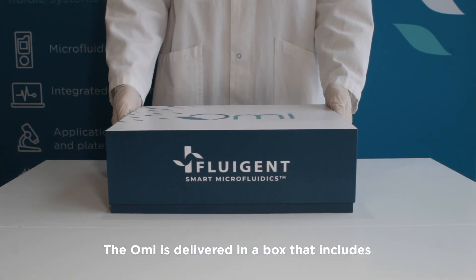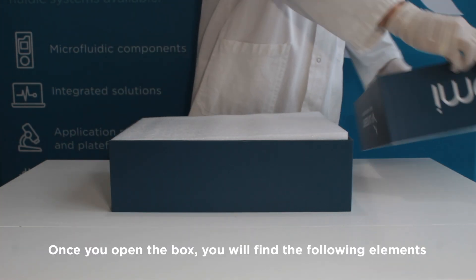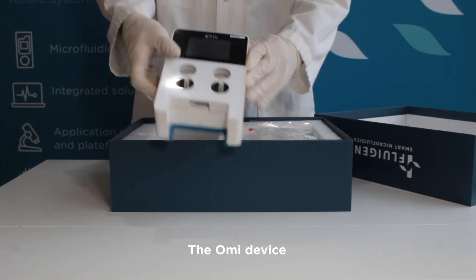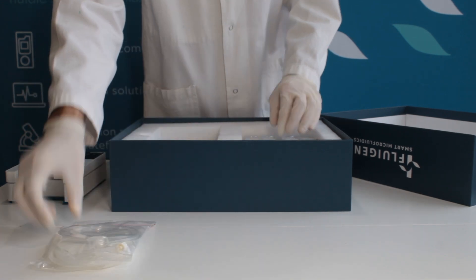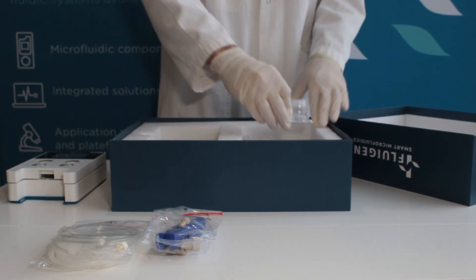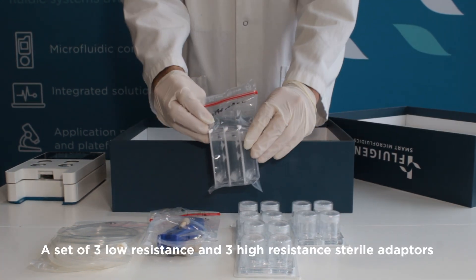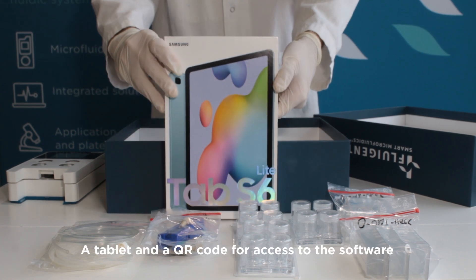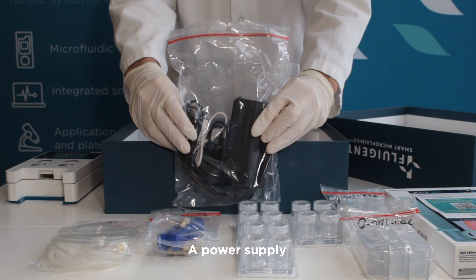The OMI is delivered in a box that includes all of the necessary accessories to perform an experiment. Once you open the box, you will find the following elements: the OMI device, pneumatic connectors, fluidic connectors, a set of three sterile cartridges, a set of three low-resistance and three high-resistance sterile adapters, the tablet and a QR code for access to the software, and the power supply.